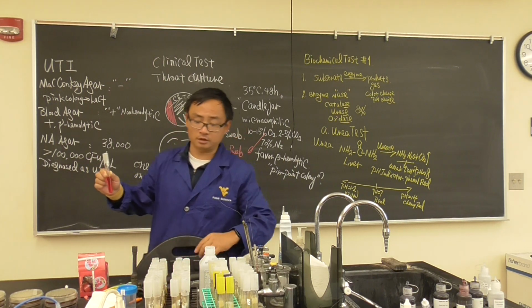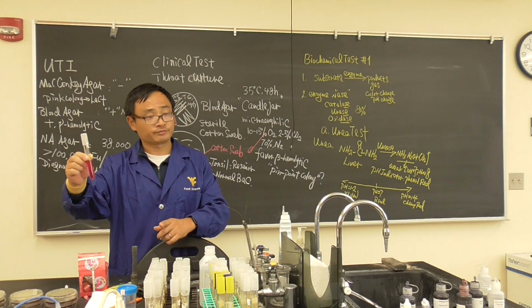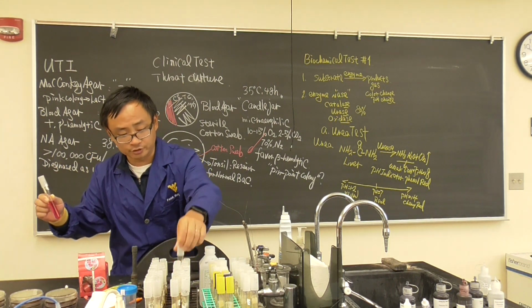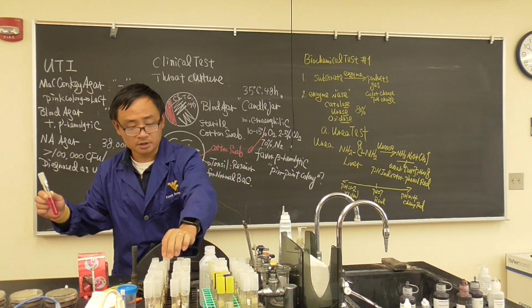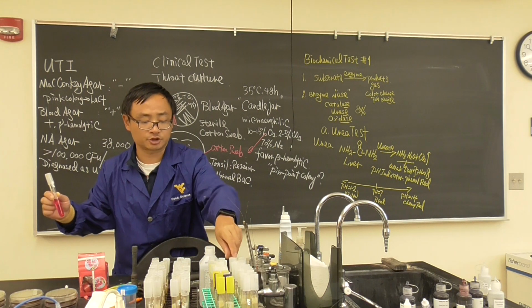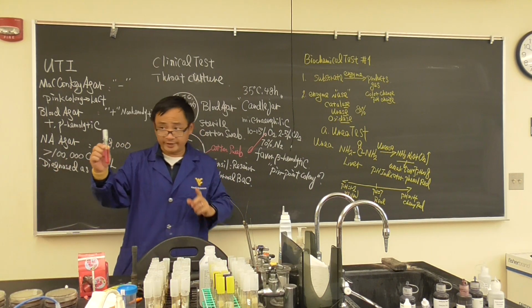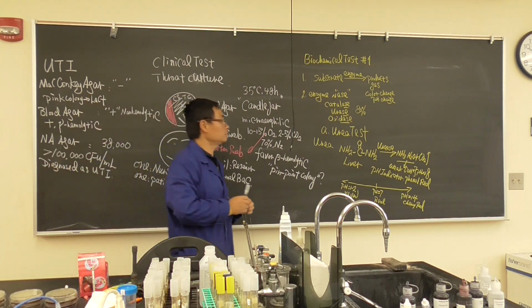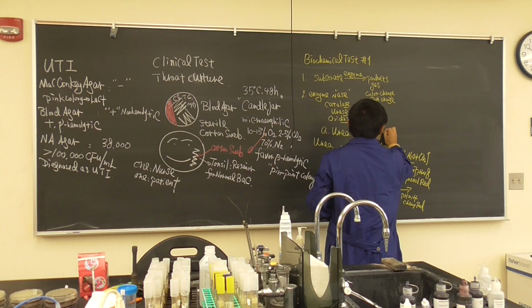Yeah. So for the inoculation, we'll arrange it, because some of you will do E. coli, some of you will do bacillus, some of you will do lactobacillus, and some of you will do citrobacter. Okay, so we're going to do an arrangement. Everyone will only do one. So the work is very simple. This is urea solution.